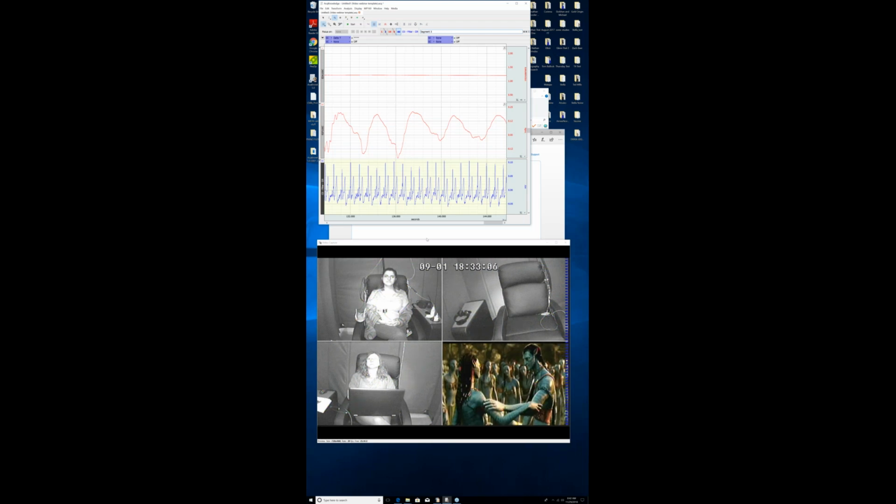We have the physiological data on the big portrait monitor, and we have the camera set up on a regular monitor adjacent to it. But because with the GoToWebinar, I'm unable to show you both monitors at the same time, I'm doing everything on the portrait, so it's probably tall and skinny for you guys. Hopefully you get a good view.